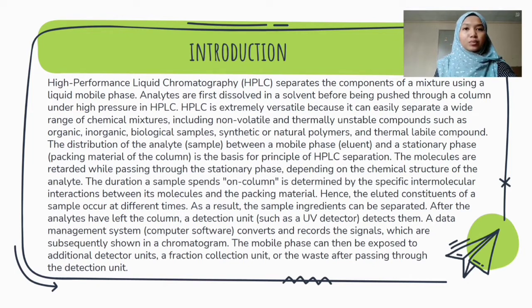HPLC is extremely versatile because it can easily separate a wide range of chemical mixtures, including non-volatile and thermally unstable compounds such as organic, inorganic, biological samples, synthetic or natural polymers, and thermal labile compounds. Next, I will explain about the principle of HPLC.